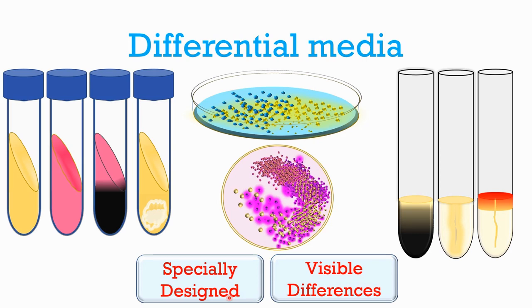Different bacteria utilize these chemicals in different ways. This produces visual differences among these bacteria when they are grown. The difference is mostly shown by the change in the color of either the colonies or the media. Other visual clues can be formation of gas bubbles or precipitates.